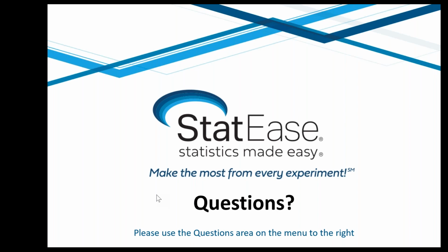I think we have time for one more. This is from Ruben Murcia, and he writes, I guess Design Expert can also be used to get the regression and hence be able to predict as you did with the Unscrambler software. Why did you not use Design Expert then? I guess he's asking why you went the direction you did.